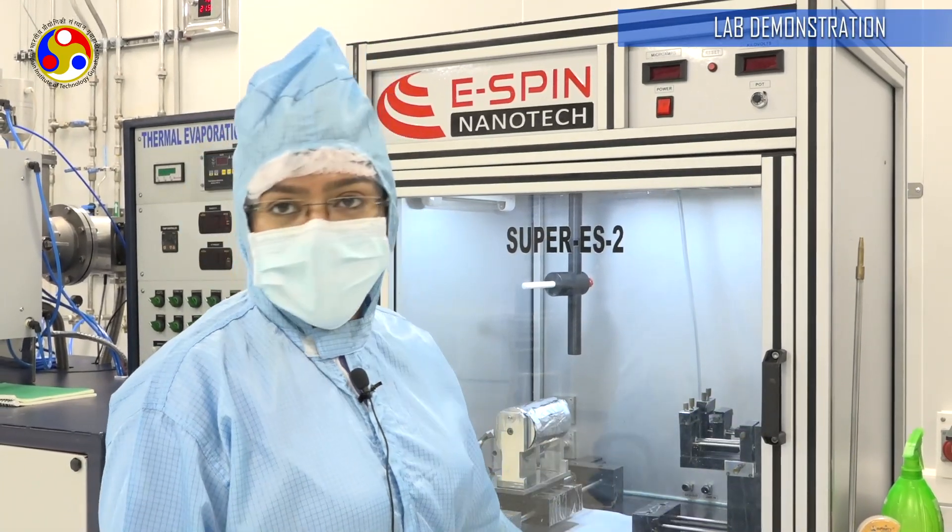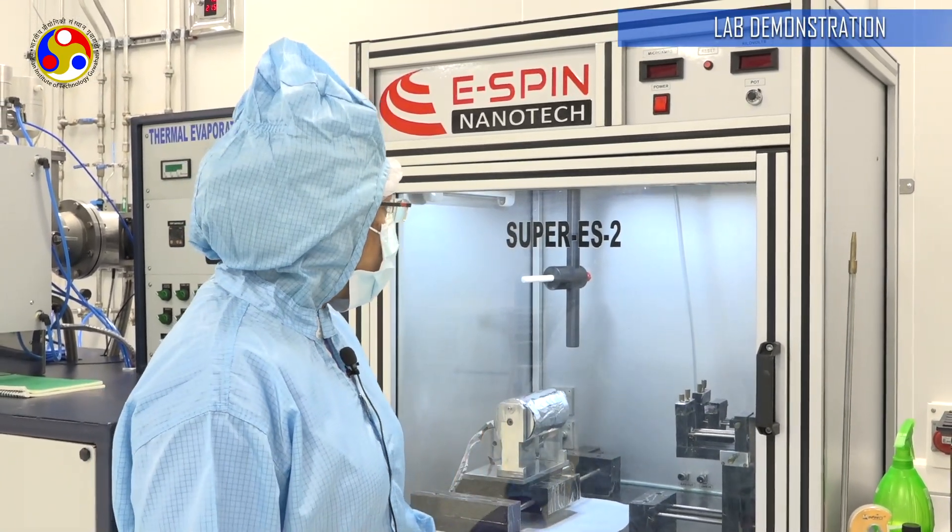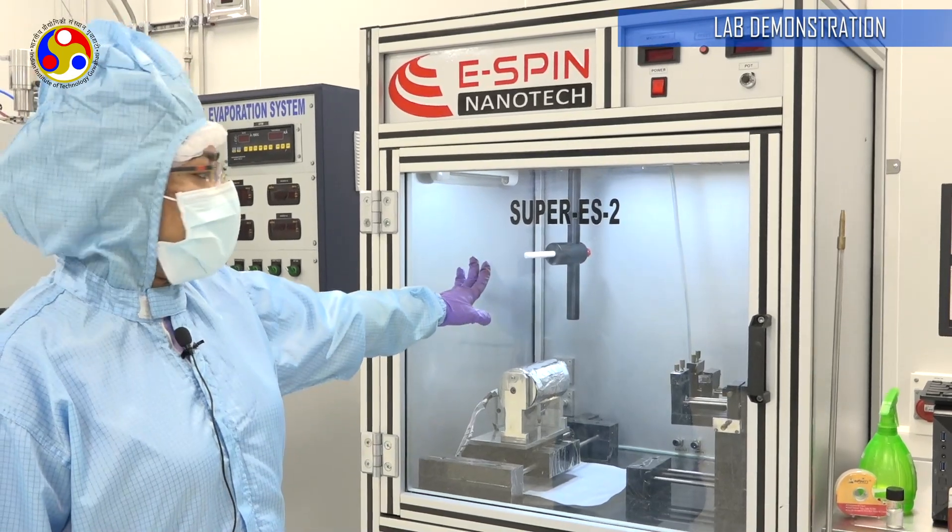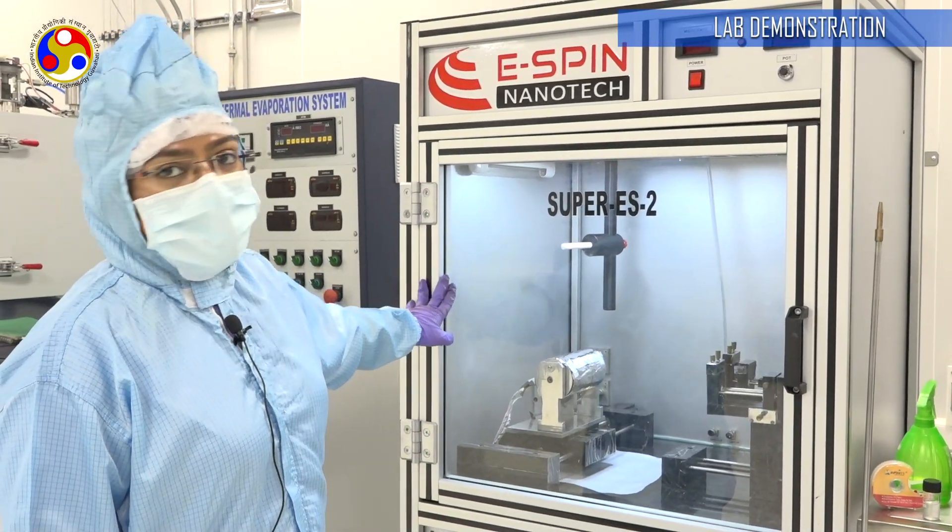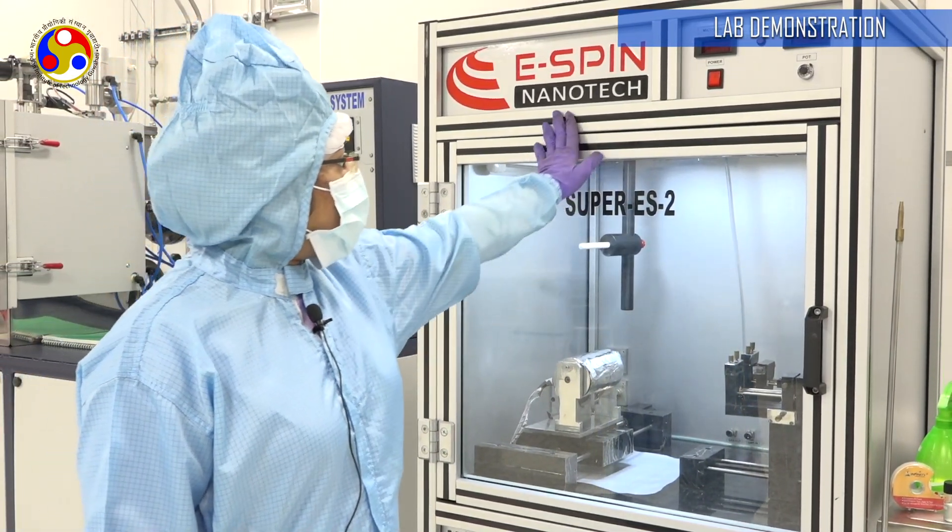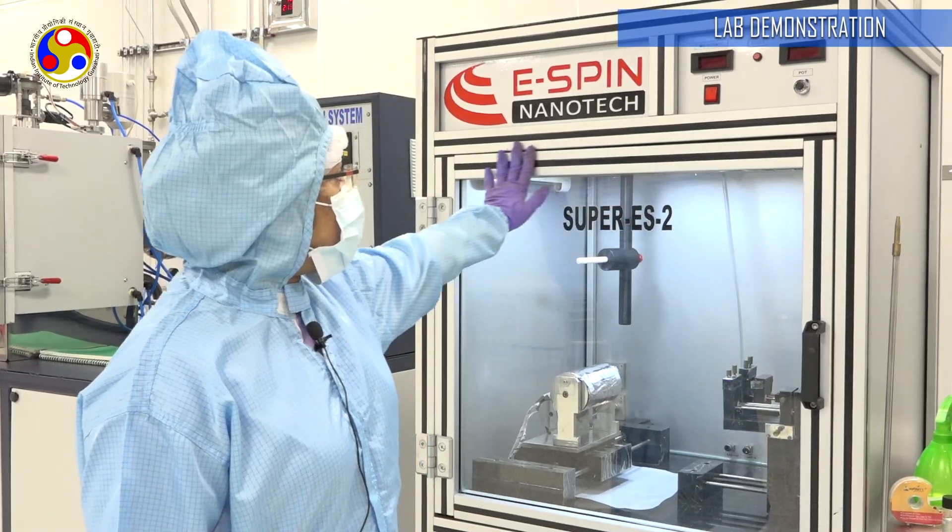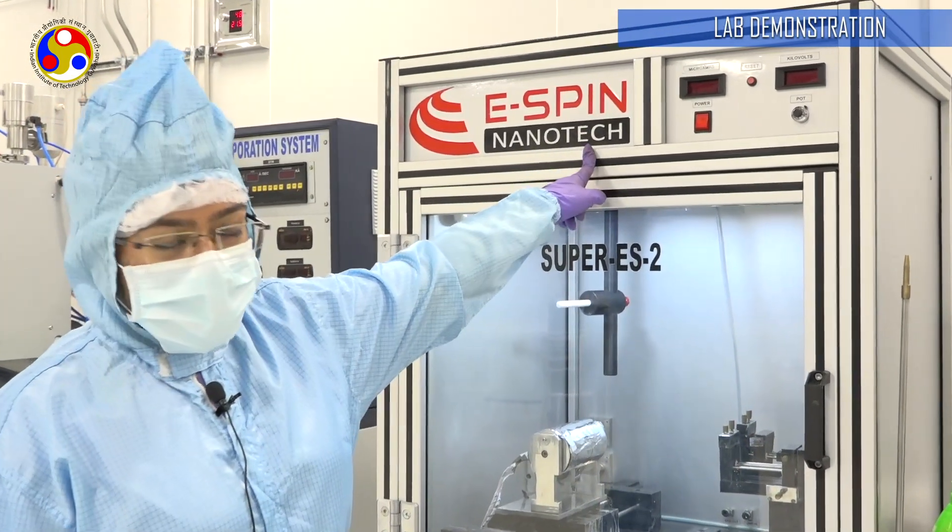I am a research scholar here at IIT Guwahati and today I am going to be presenting a demonstration of our electrospinning device here at the Centre for Nanotechnology.